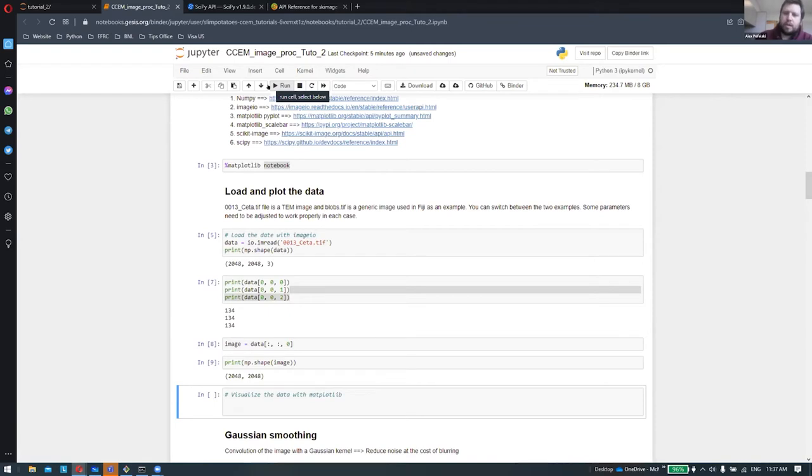Okay, so the reason I'm showing this is that this happened many times, where the data has not been saved as raw data. You have a display, you have no metadata, for example, in this case, and you still want to be able to do something from this data. So it's possible. You just need to look at what is inside and come to the case where you want to apply your filtering or any other type of processing. So now we have the data in a certain shape. We can now visualize it to see quickly how it looks.